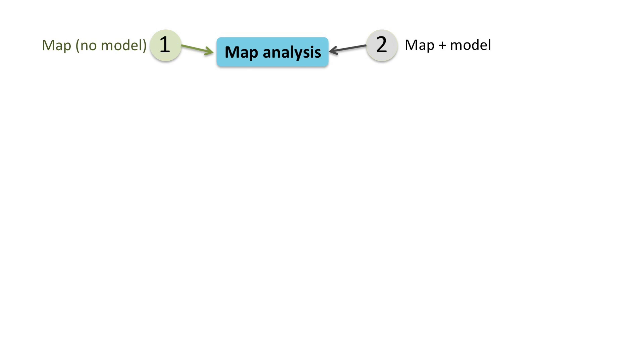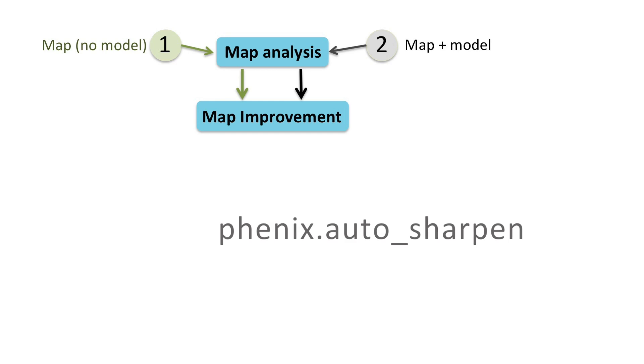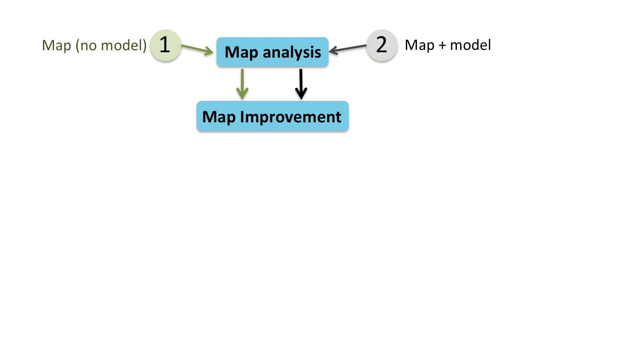The first program to use is mTriage, which tries to assess the quality of the map and establish knowledge of certain pathologies that might be present. The next step is to obtain a sharpened map. This task can be performed with Auto-Sharpen. The program automatically identifies the adjustment to create an optimized map.